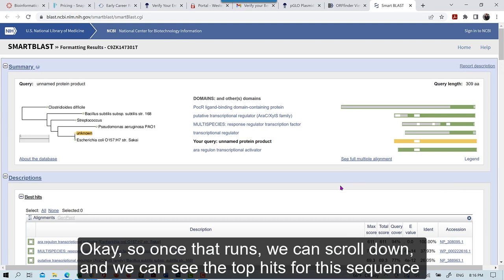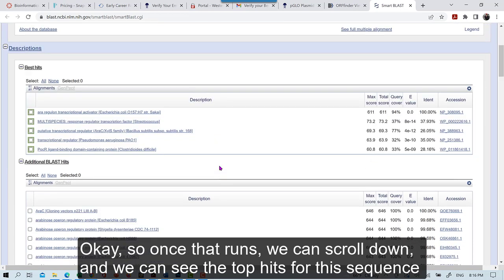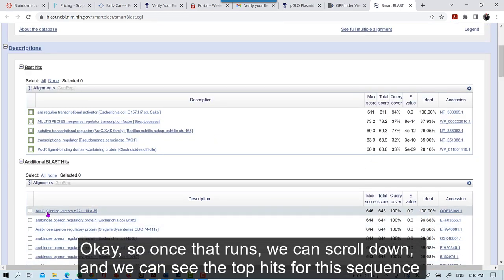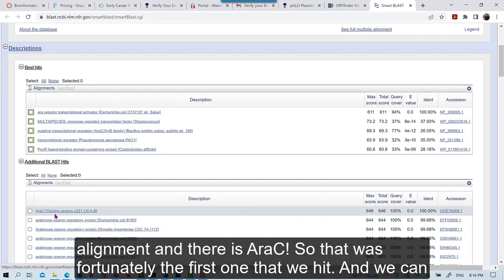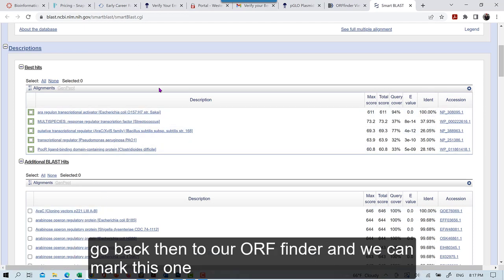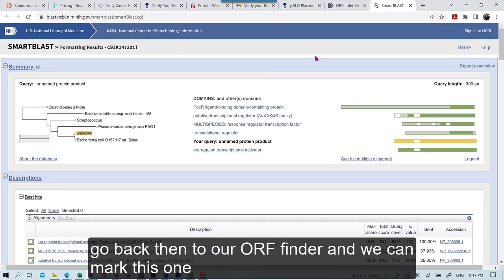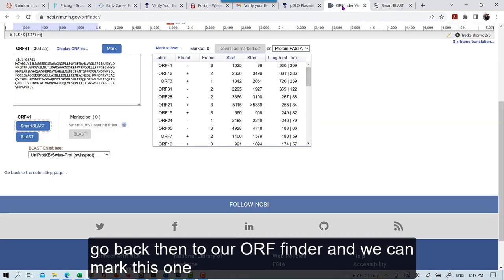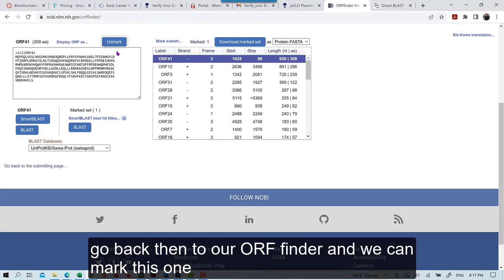Okay, so once that runs, we can scroll down, and we can see the top hits for the sequence alignment. And there is AraC. So that was, fortunately, the first one that we hit. So we can go back then to our ORF Finder, and we can mark this one.